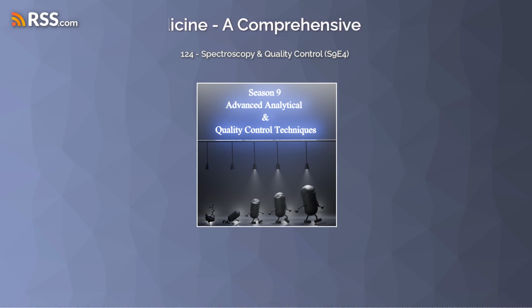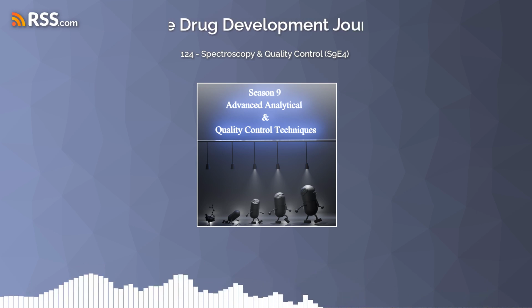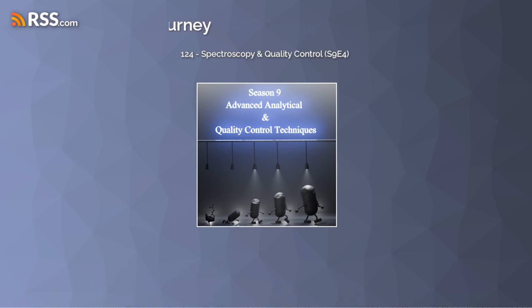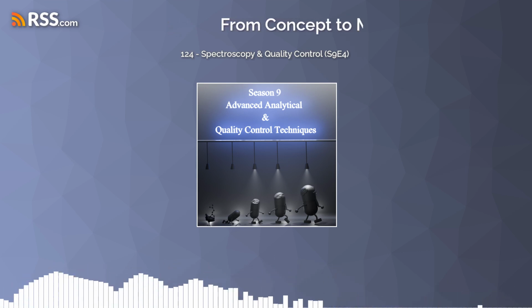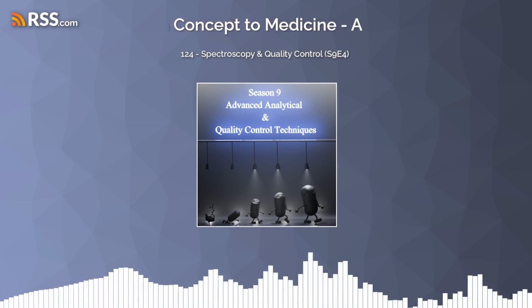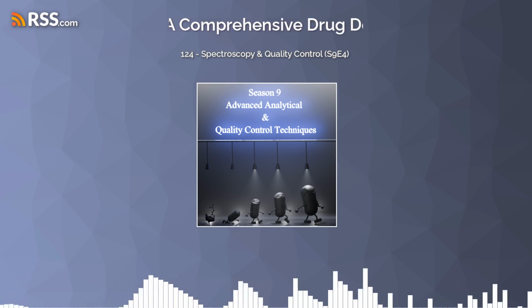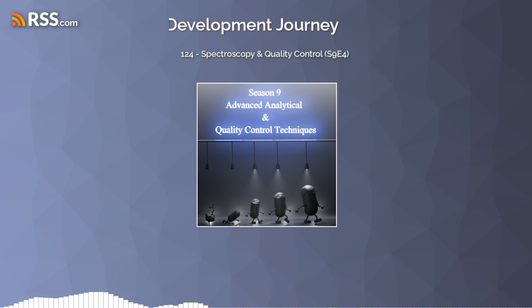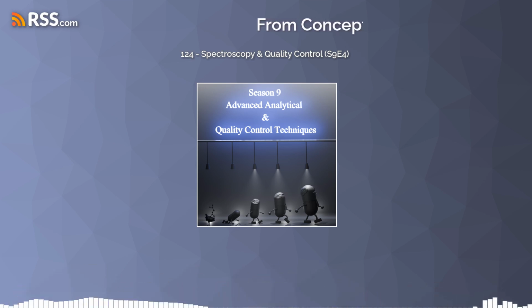What about purity? Purity is absolutely critical as well. And spectroscopic techniques can also be used to detect and quantify impurities. So if you're looking at a spectrum and you see some unexpected peaks or deviations from the pure standard, that's a sign that something else is there, that something might be a contaminant. And that's important because impurities could affect the efficacy of the drug. They can also have toxic effects. So you really want to make sure that your drug substance is as pure as possible.